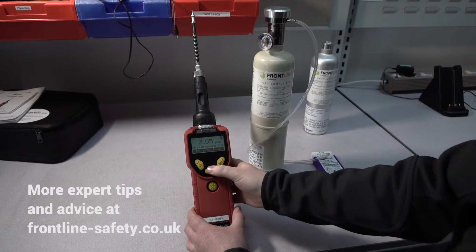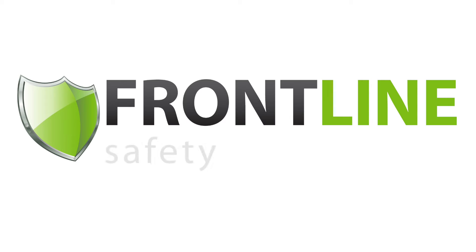And that's how quick and easy it is to calibrate the Q-Ray 3000.